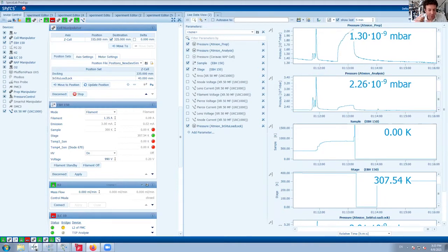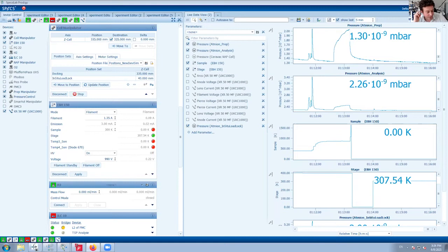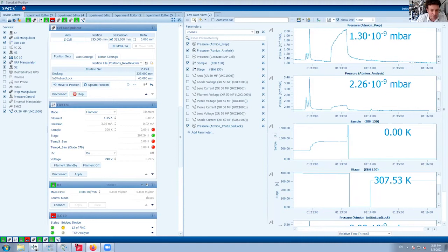The other way is we have one sample holder which is exactly this kind of shape, and there is a small hole drilled in the middle, about 3 millimeters in diameter, and you can also put the powder in, put it between two weighing papers and press it.